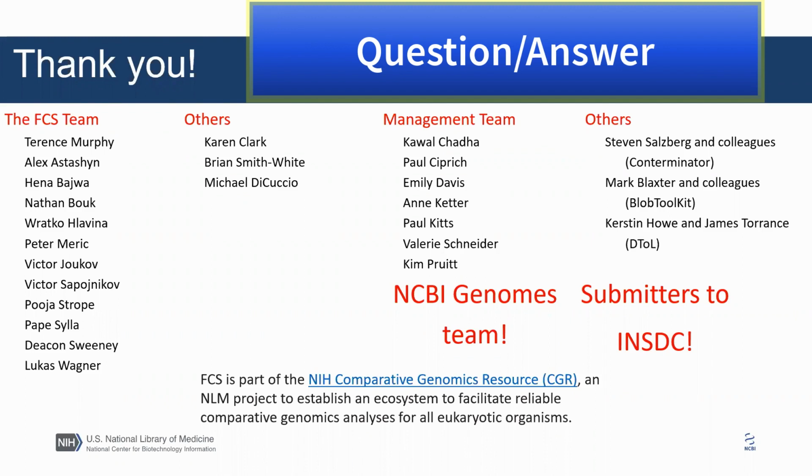And if we find new issues, we plan to release new database versions, but the goal here is that we want the database releases to be pretty far apart. And so we want to do a lot of the heavy lifting in terms of the contamination removal up front, and minimize the timeframes between successive database releases.